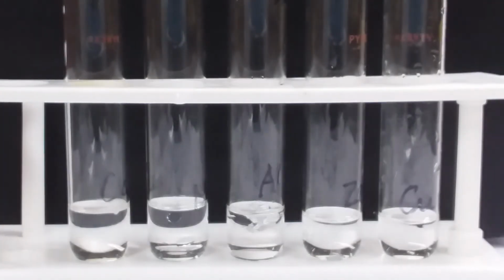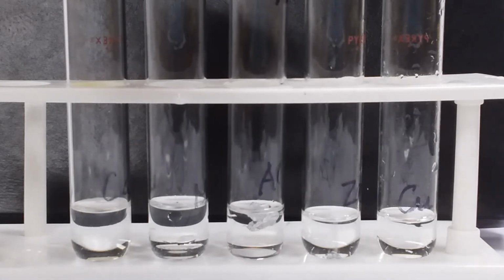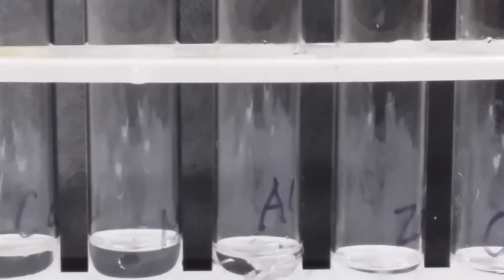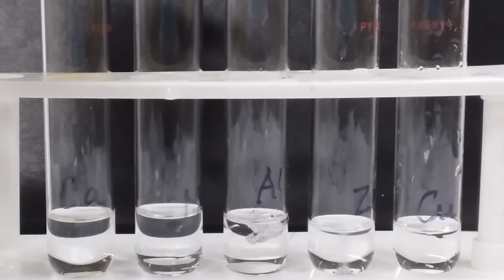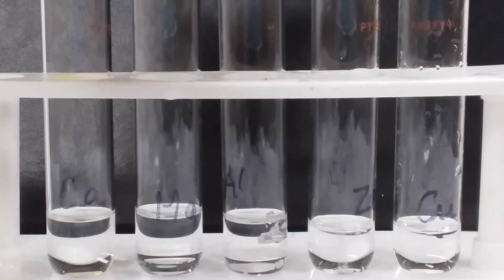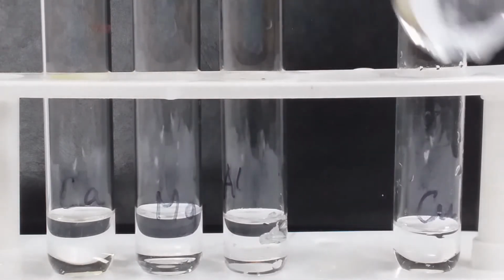So I'm just going to let this sit here for a little longer. Zoom in a bit more. Calcium has all reacted, magnesium has all reacted. Zinc is going a little bit more rapidly.